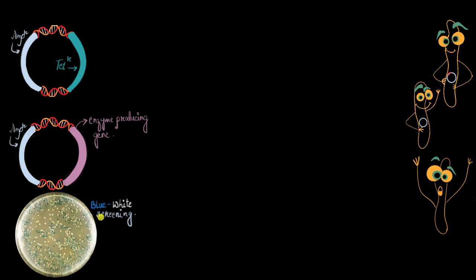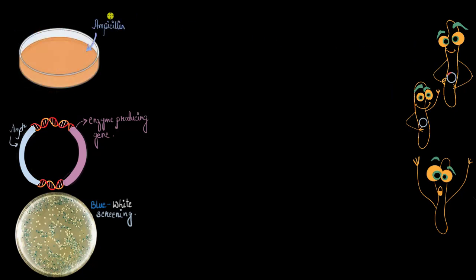All right, let's begin screening then. And we begin by getting rid of cells that do not have the plasmid inside of it. And we do it just the way we discussed in our previous video. We insert an antibiotic-resistant gene into the plasmid. And what happens then? All the cells that have the plasmid will have this antibiotic-resistant gene except for this poor fellow here who could not even ingest the plasmid. Now the antibiotic-resistant gene we have used is resistant to the antibiotic ampicillin. Now when we allow the cells to grow in a petri dish that has ampicillin, this poor fellow won't even grow in that medium. So we will get rid of cells that do not have the plasmid inside of it.